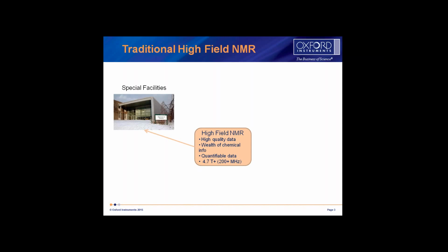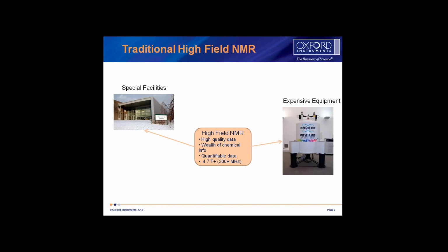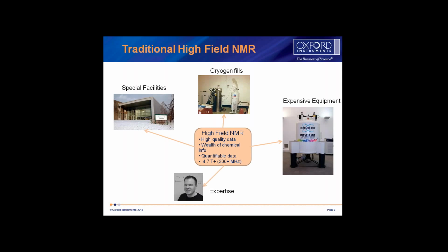Firstly, they usually require specialist facilities for the instrumentation. The instrumentation itself is expensive. There's regular liquid nitrogen and liquid helium cryogen fills to be carried out, and you usually need some sort of expertise for carrying out experiments.